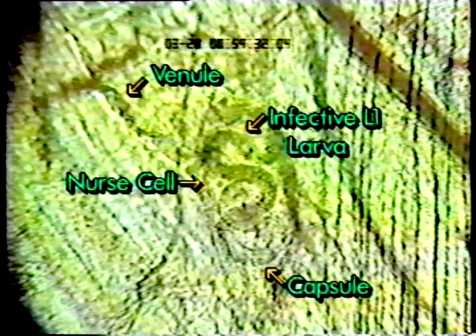Under low magnification, the circulatory reedi, the nurse cell, and the L1 larvae in its intracellular niche are clearly visible. Something of the nature of the vessels that surround the nurse cell can be discerned by observing the flow of formed elements within them.